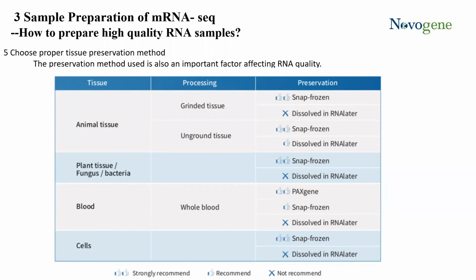Also, frozen materials should be stored at -80, and please avoid repeated freeze thaw cycles and keep them at a minimum as they enhance nucleic acid degradation.